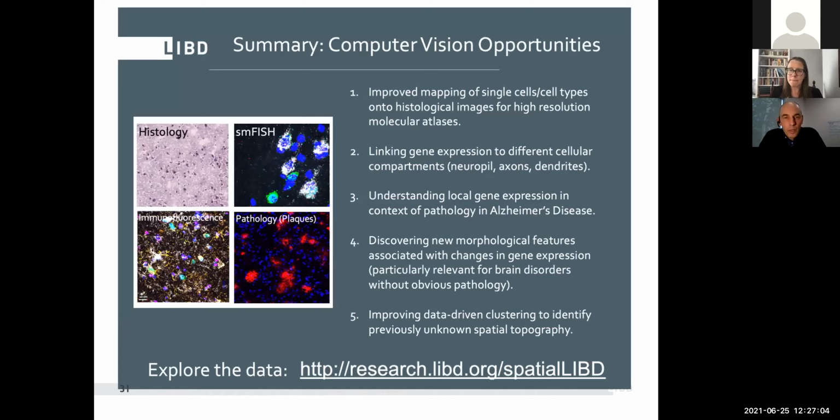Maybe I could start with a quick question that's technical and straightforward, but does address one of the current limitations, and it's really number one on this list. When you describe a spot, and you said it's about 50 microns in diameter, in terms of nuclei size, that's somewhere between 1 and 10 nuclei, depending on the packing density.